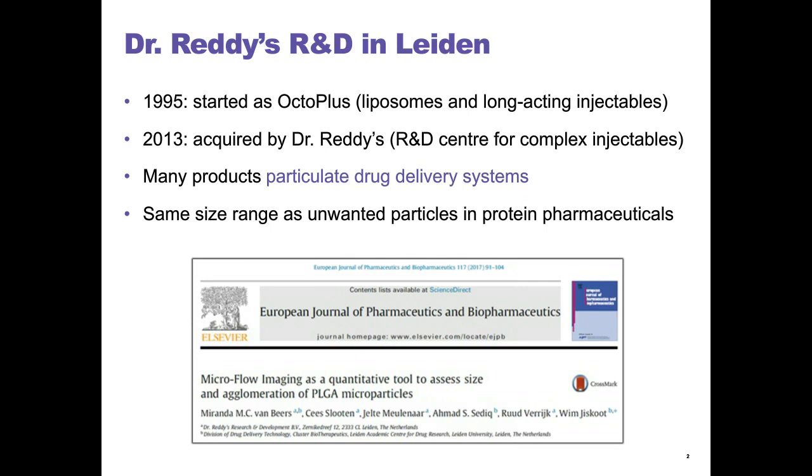Together with Leiden University, we started exploring several particle characterization techniques that were recently established for protein pharmaceuticals. MFI proved to be particularly useful in measuring our PLGA microparticle products. We recently published our results, and in this webinar I would like to share with you some of the highlights and ins and outs of this publication.